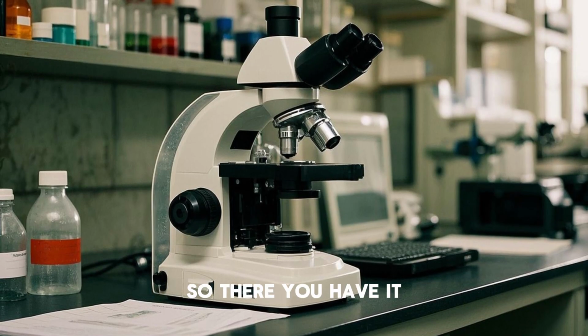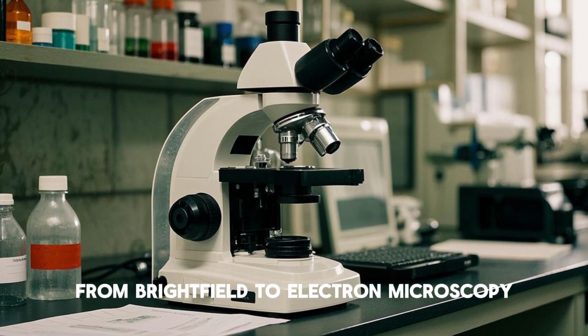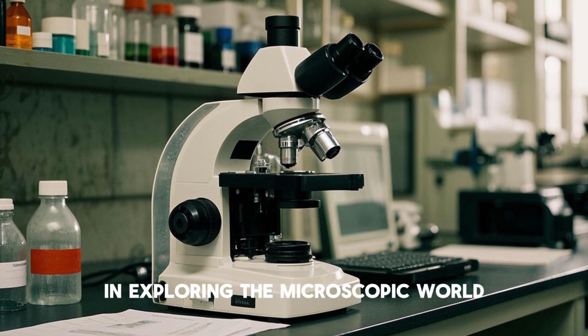So there you have it. From bright field to electron microscopy, each type has its unique role in exploring the microscopic world.